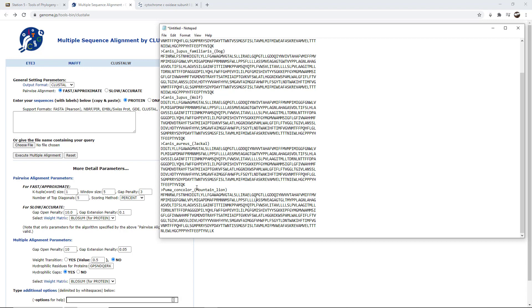That is, it's related to the dogs in that they're both in the order Carnivora, but it's not within the dogs. And we're going to use that to help separate the dogs out so that we see how they're related to each other.